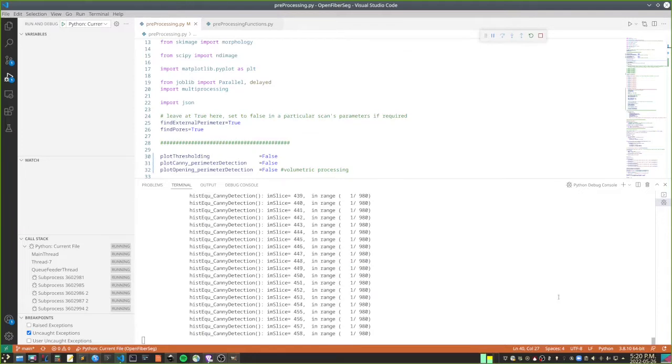Okay. So the zoom out data set is mostly for porosity detection and the zoom in one is usually for fiber tracking, right? Yes, if you want to do the tracking of fibers, our fibers are about 7 to 10 microns, so the pixel dimension needs to be less than 1 micron, or you won't get enough pixels for the machine learning to see them. Okay, great.